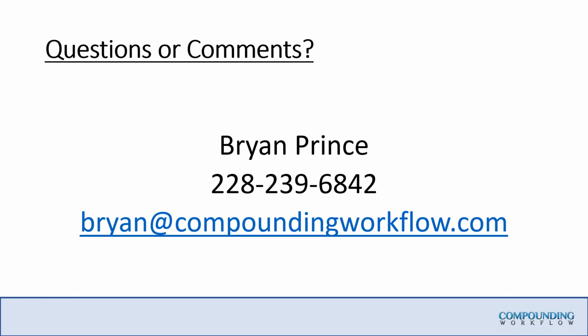Great questions. Let me see if I covered everybody's question. And Heidi said, yes, that's 503B. Yes, Heidi, I would do for 503B, the FDA and CGMP wants to see process and people in one direction. So you would do an entry ante and an exit ante.